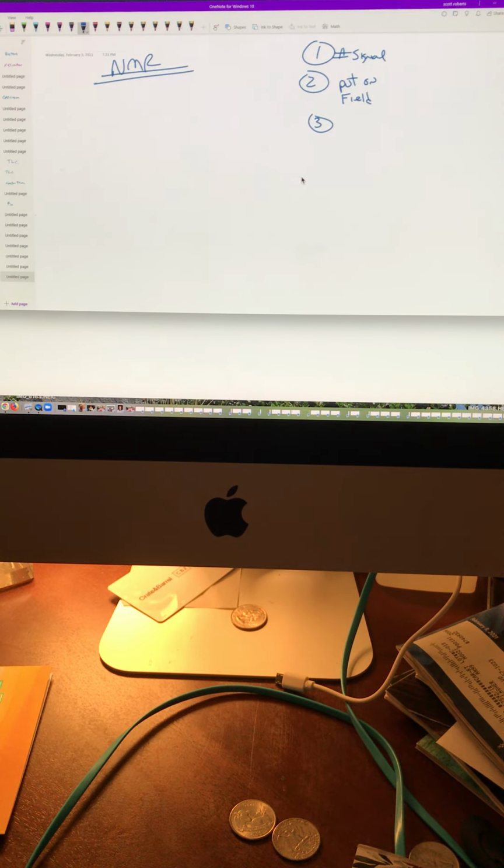Number three, you are going to analyze each signal, and each signal is the n+1 neighbor rule. And number four, you are going to determine the height of the signal. I got news for you. Number one almost always gets you the answer.